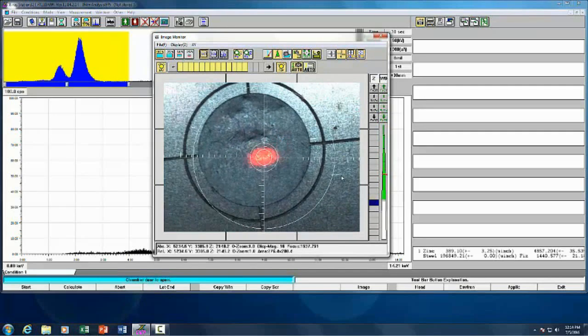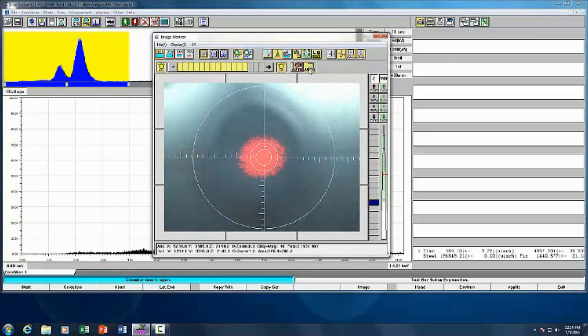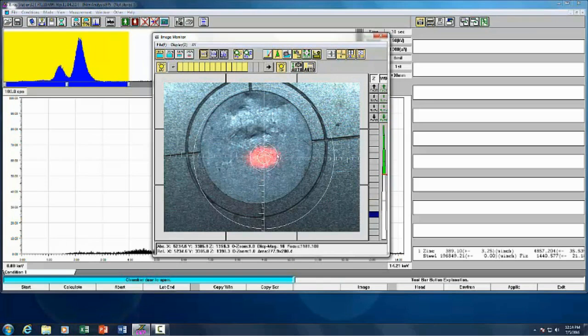Automatically moves the camera, but our head did not move. It indicates the head movement over here in the green arrows. We want it to be at the red mark here. That's that focal depth that we calibrated at. Let's hit Auto Approach. It moves the head to the distance we calibrated at. Readjust the camera. It's just that easy.